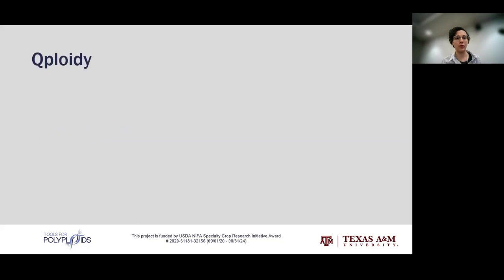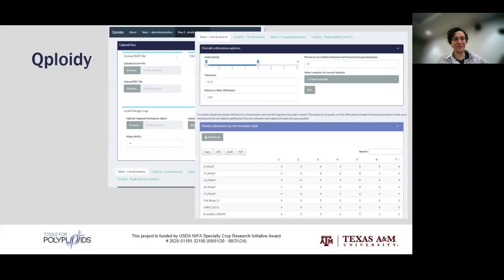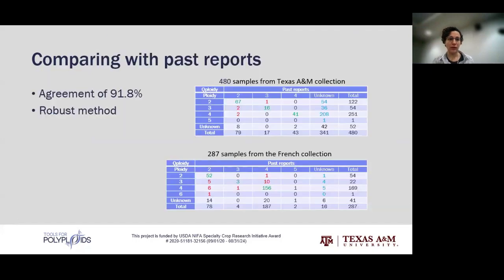But what we have so far, I implemented in a Shiny app, of course, because as you know, I have been showing Shiny apps. It shows and does analysis automatically in all individuals and shows all these plots. And so we applied this to the roses. Yes, I have time. Okay.